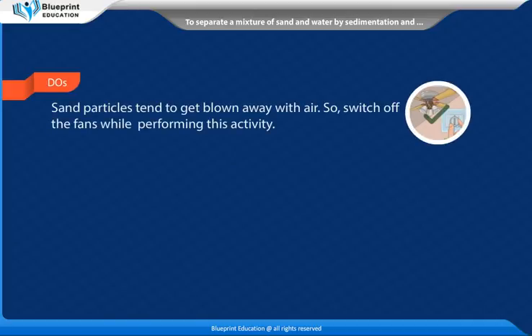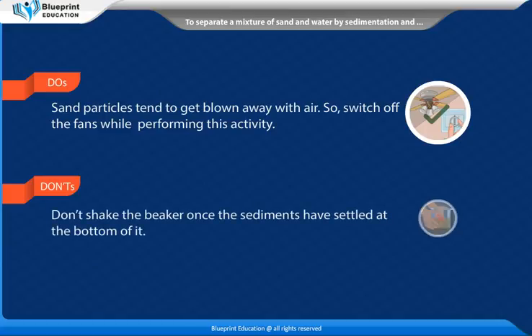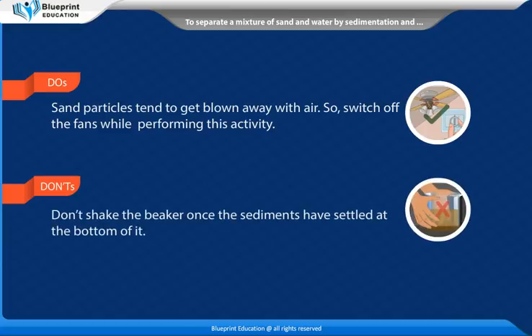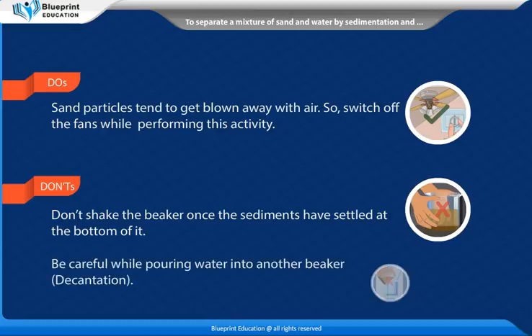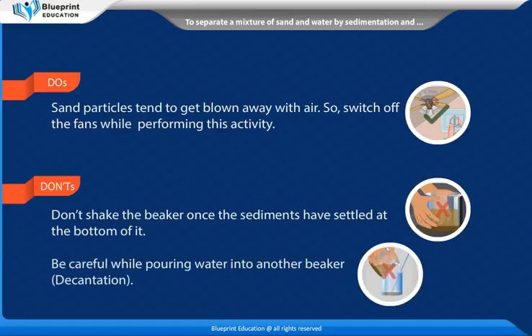Do's: Sand particles tend to get blown away with air, so switch off the fans while performing this activity. Don't shake the beaker once the sediments have settled at the bottom of it. Be careful while pouring water into another beaker during decantation.